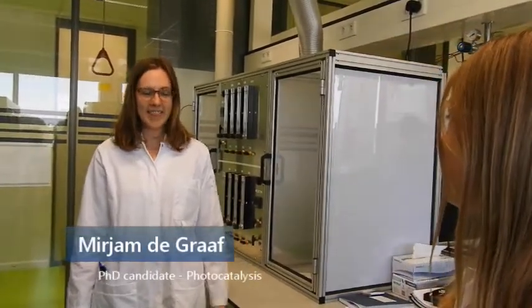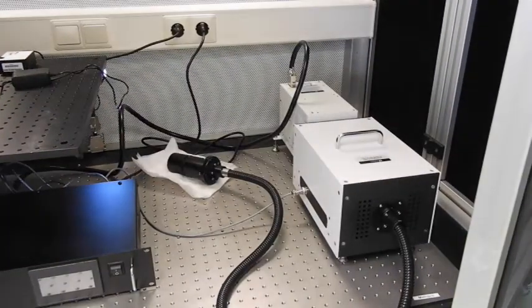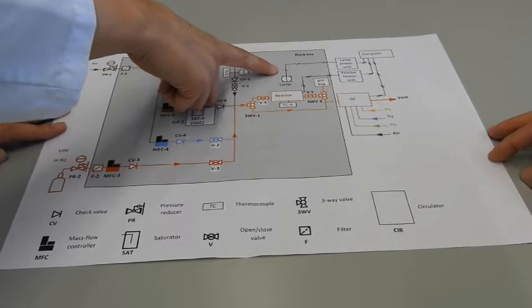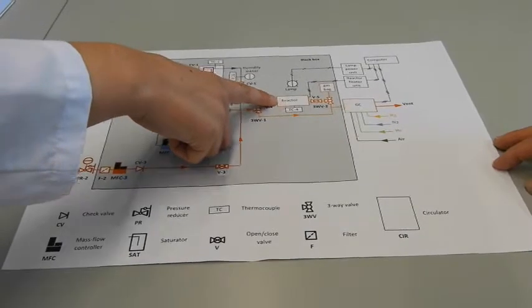Hi Miriam. Hi. So can you tell me a bit more about what you're doing here? Yeah. So here I'm building a setup where I can test nanomaterials that can perform catalysis using light as an energy source, in other words photocatalysis. This is still a work in progress, but I've already made a design of the setup that I want to build. And actually we already have one of the most important parts here, which is the solar simulator that can imitate sunlight. So I can shine this solar simulator, a lamp, on a reactor containing a photocatalyst and initiate photocatalysis this way. And I also want to use other light sources such as LED lighting that can simulate room lighting.